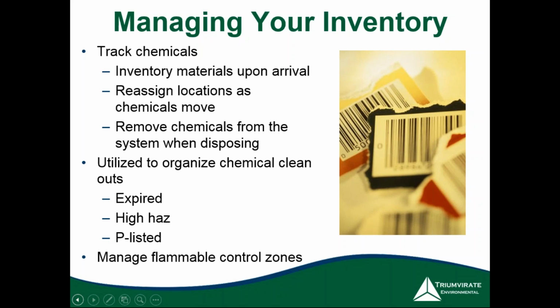Down below we talk about managing flammable control zones. If you get material that's moving from one area to another and you're not tracking that, you can get a buildup of materials in certain zones. If you have a flammable zone that's getting an accumulation of flammables and you're not tracking that, you might not realize that you exceed your flammable permit, and you can run into some compliance issues there.